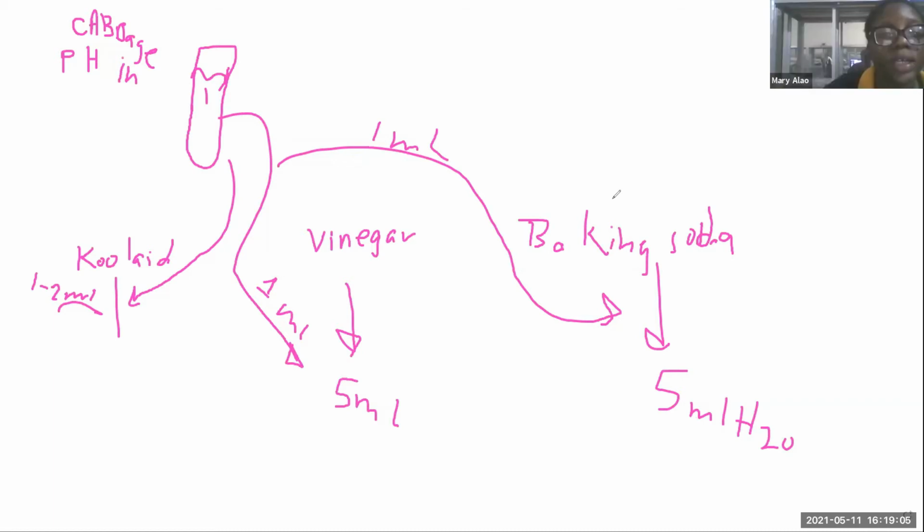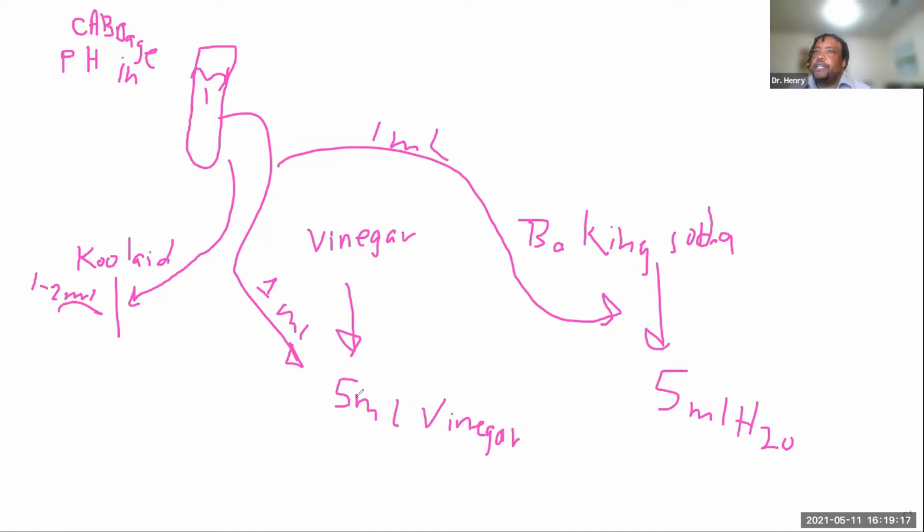Okay, so just to be clear, in the middle is 5 milliliters of vinegar. That's right. Okay, Dr. Henry, after I get all these numbers, that's the only information I need, right? That is the only information that you need. You also have the volume of how far it bubbled up, right? Yes. Okay, so that's going to allow you to calculate the number of moles of acetic acid.